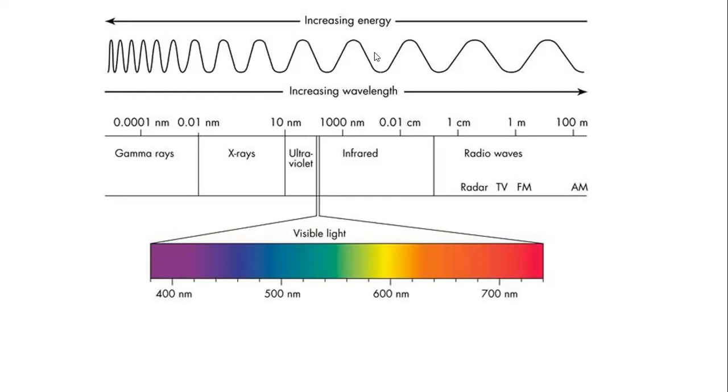That means if you are judging the amount of light absorbed and comparing it with the number of entities present within your sample, then it becomes mandatory that you use a monochromatic or a single wavelength light radiation, and whose energy values are exactly the same as the energy requirement of the electron.